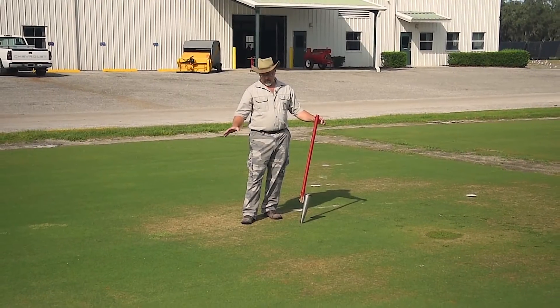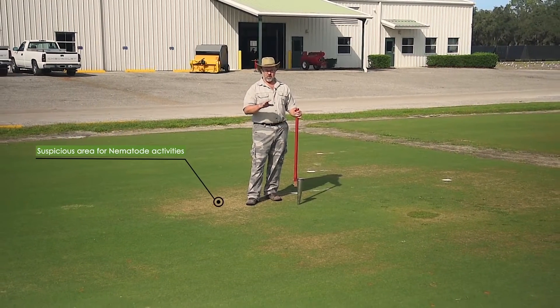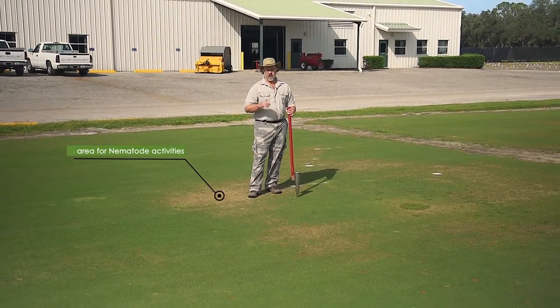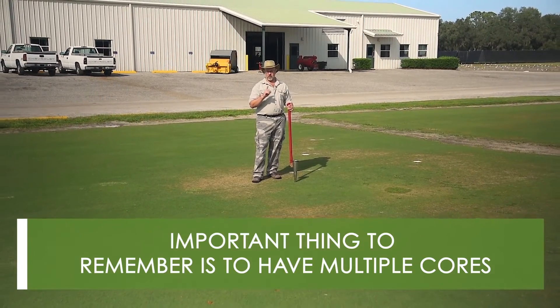Here we have an area that looks suspicious for nematode activity. We want to determine if nematodes are what's causing this turf decline. Now when we're taking our nematode samples, one thing to remember is we need multiple cores.